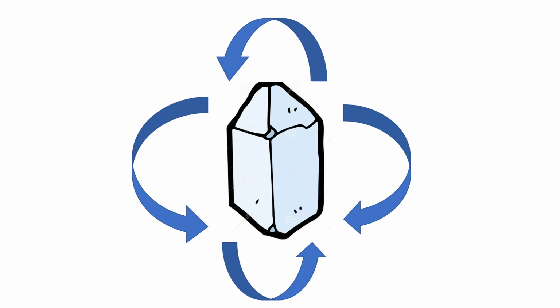The crystal is moved in a 360-degree pattern in order for the whole crystal to be imaged using the X-ray beamline.